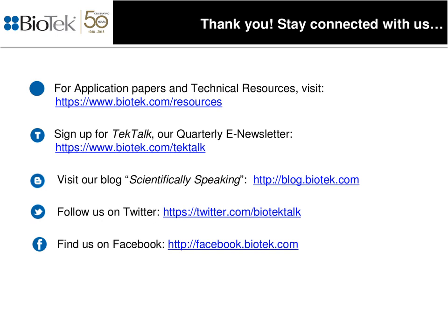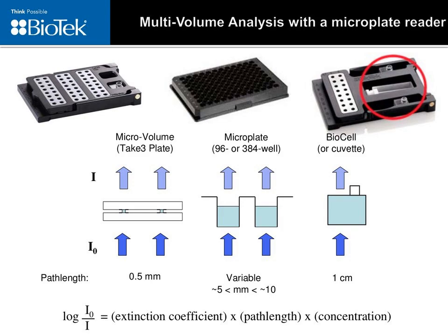Second question, do you have 96 well micro spot plates? We have a 48 spot plate, essentially the Take3 Trio, which I believe was shown in one of the earlier slides. The Take3 Trio has 3 slides in it, and each one is 16 spots, so that gives us a total of 48. However, the trade-off is that it does not have a spot for the cuvette and the biocells. Those are taken up by the additional slides. However, you could have both in your lab, and that would allow you to have both of those options.